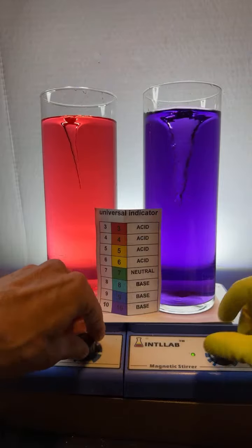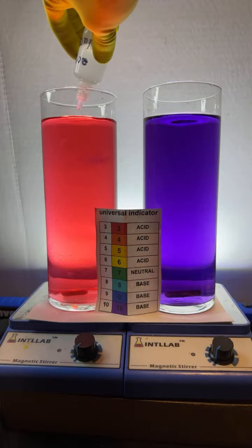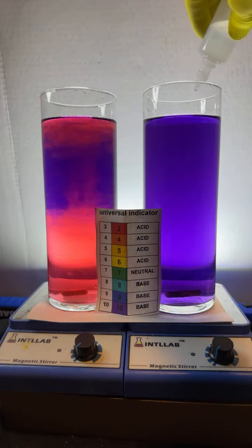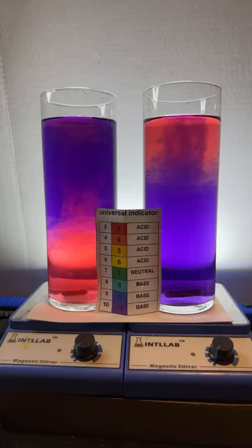Okay, here we go. I'm going to turn these off, and we are going to add a bunch of base over here. 4 drops. And then on this side over here, we're going to add 4 drops of acid. I did 3, didn't I? Let's do a 4th. And it's like we're seeing the northern lights, the chemical northern lights.